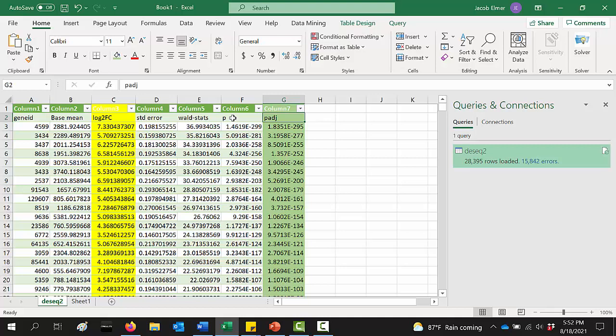Okay, so when we're considering which differences are significant or not, as that type of analysis tends toward infinity, you might have some things that appear to be significantly different because the sample size is so large, but they're actually not. And so just in a nutshell, that's the correction that we're using here with the p-adjustment. So this is a more stringent analysis of statistical significance here, and that's what we want to use, okay?